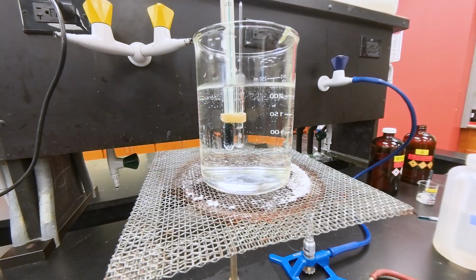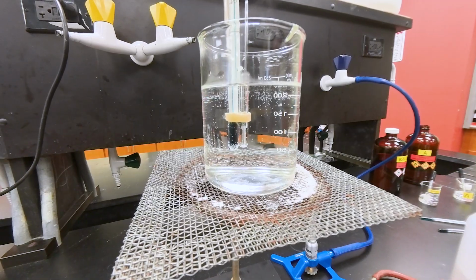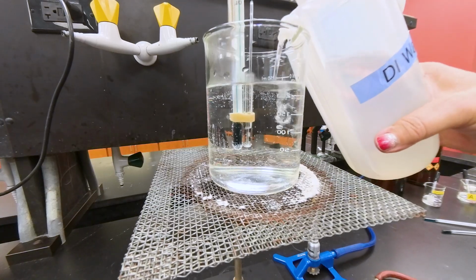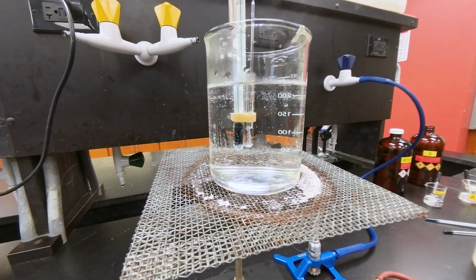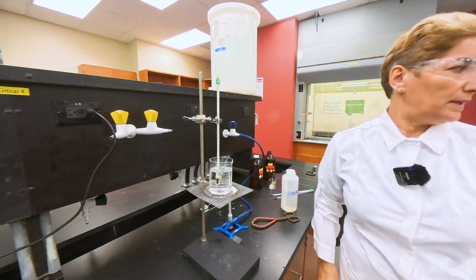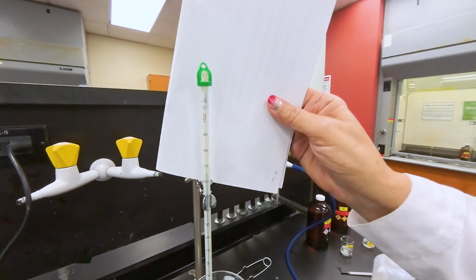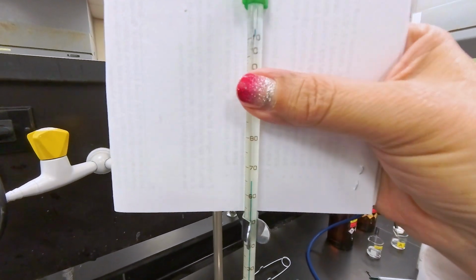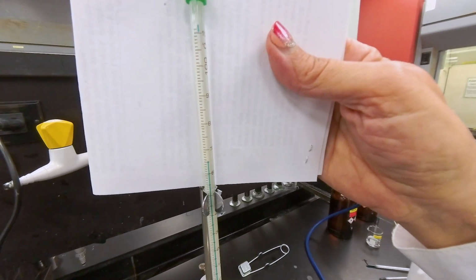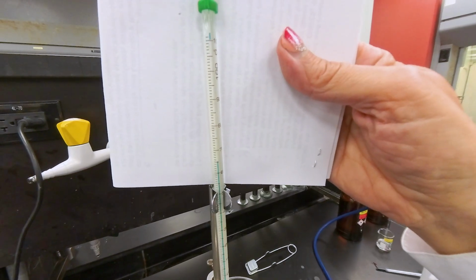Okay. Now it's separated. You see that the bubbles are coming one at a time. I can see separate bubbles coming out. And we can focus on the temperature now and record the temperature with the close-up. Now, one bubble at a time. Now we record the temperature here. That's the boiling point for our unknown sample, which you record with 1 decimal place using this close-up.